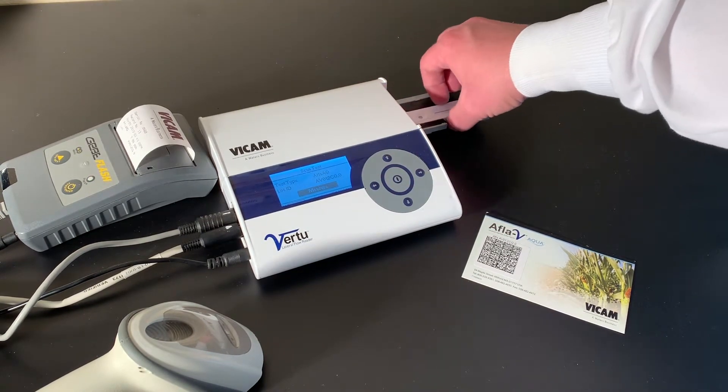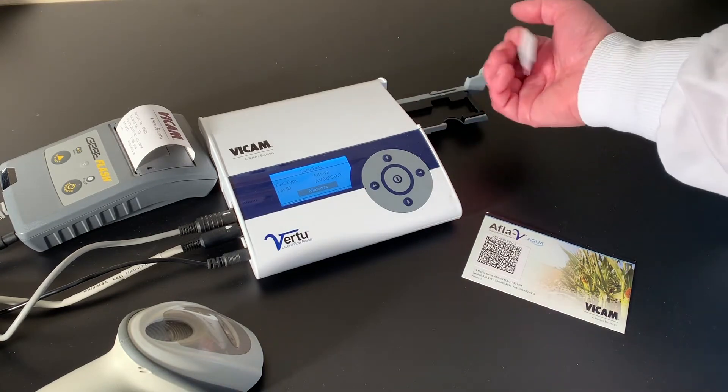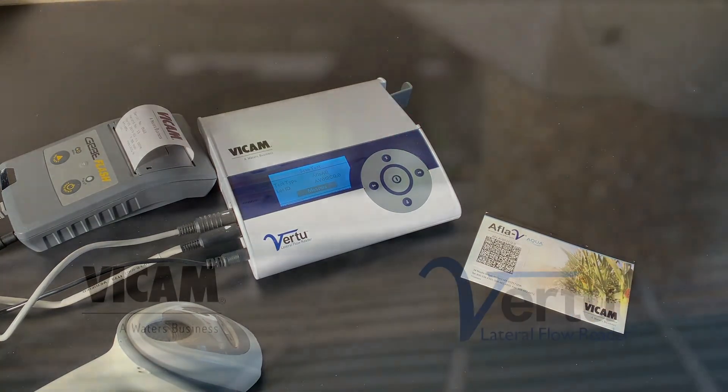Dispose of the cartridge, filter paper, and extraction tubes. Wash the funnel with clean water. You are now ready for your next test.